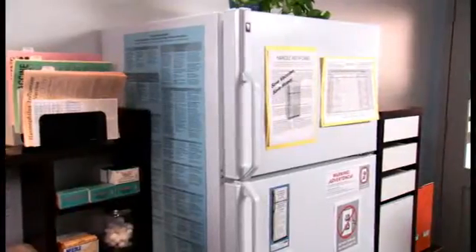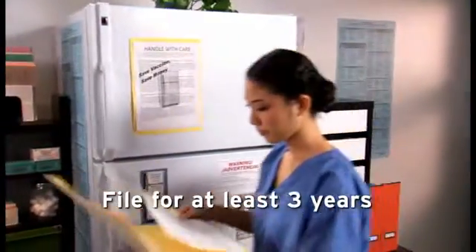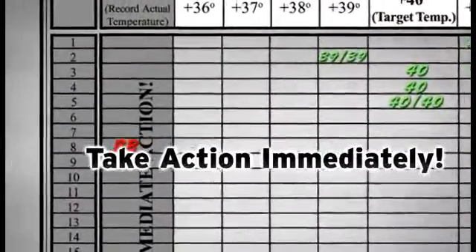It is important that you keep temperature logs on file for at least three years, unless state statutes or rules require a longer period. Twice-daily temperature monitoring is not just useless paperwork — if the temperature in the refrigerator or freezer is out of range, you must take action immediately.